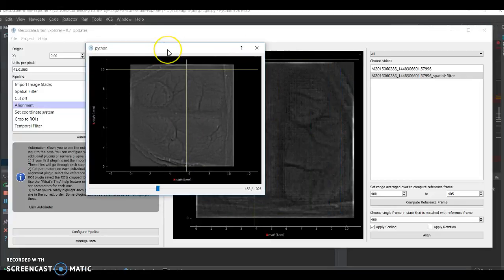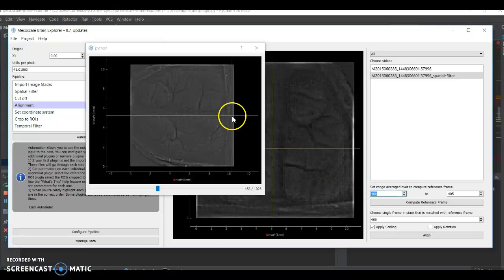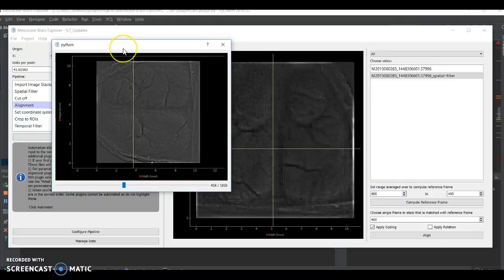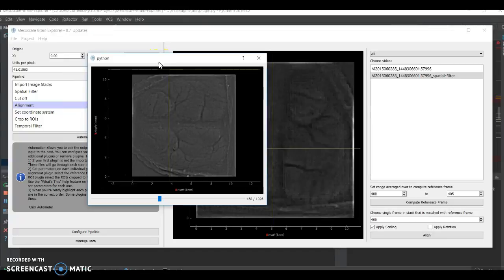The second mistake, which also had to do with alignment, was when you were averaging in version 0.5, a previous version. You were actually averaging across videos, so across image stacks, but for only one frame. Some reflection should make you realize that this is drastically wrong because these files would not be aligned. That would smoosh up your template to the point that it's not a good idea to use. Unless, of course, in my case, my data was already pretty well aligned, so it didn't make that much of a difference for me. So I never noticed that I was making that mistake.